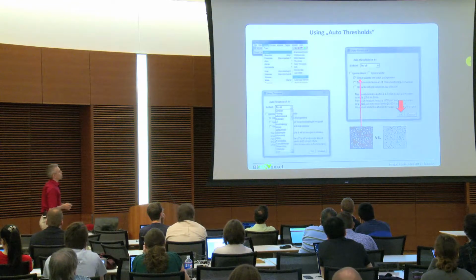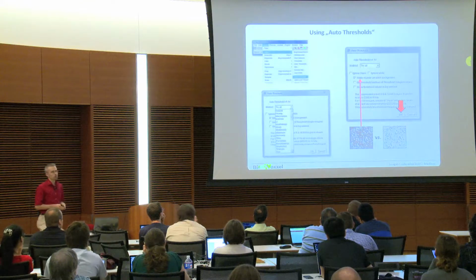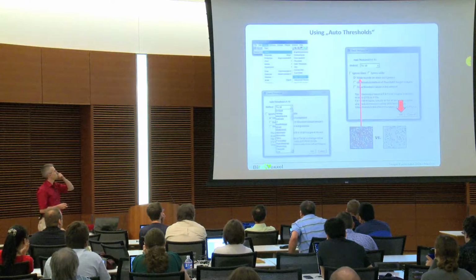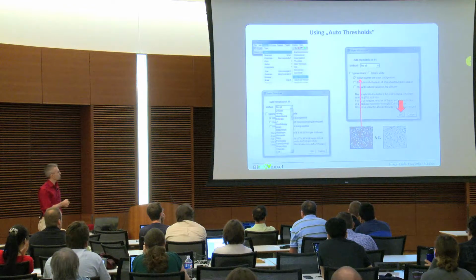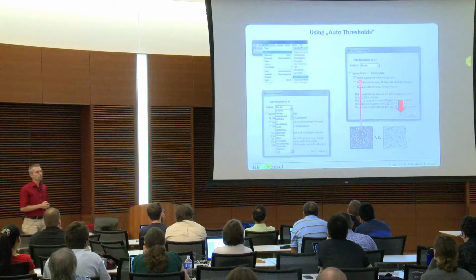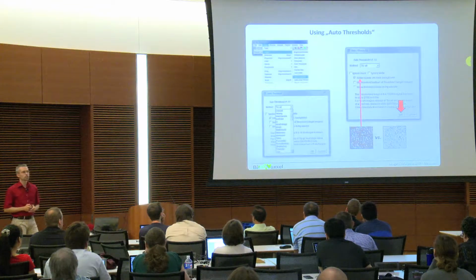And this is a very nice tool. If I'm not mistaken, it was also initiated by Gabriel Landini, which offers us that here. We have 16 different methods, and if you go to the Fiji homepage, you will also find the publications listed there.